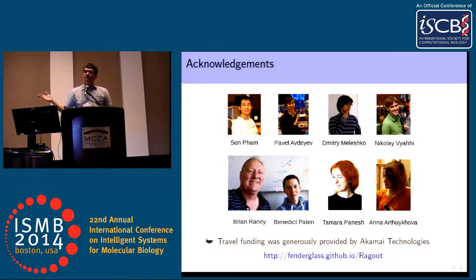For instance, if we have 5 Drosophila genomes, we can align them in 5 hours. And actually, the Ragout part, the breakpoint graph analysis part, is very fast. It's just a few seconds. So yes, the algorithm of analysis of the breakpoint graph itself is quite fast. Thanks.